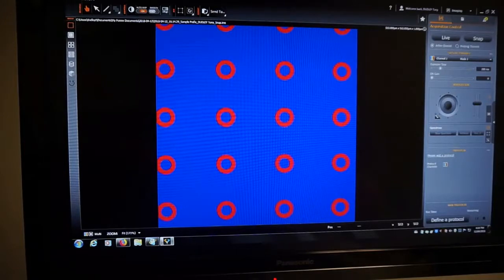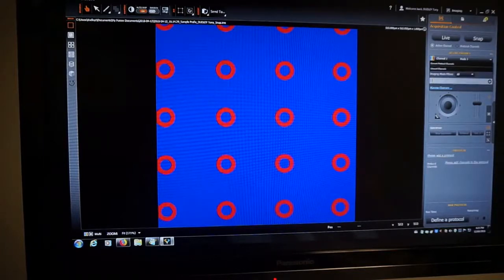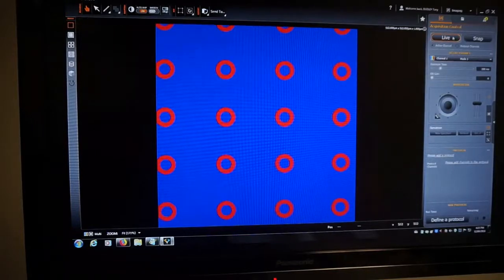Okay, so it's just a way to select between those two. You can also choose your channels here. Okay, so this is analogous to IQ. We haven't really defined channels yet, but you can add and subtract channels from the list here, right?